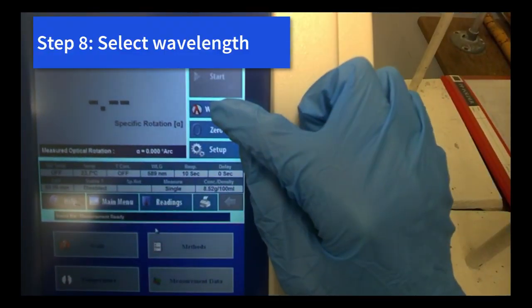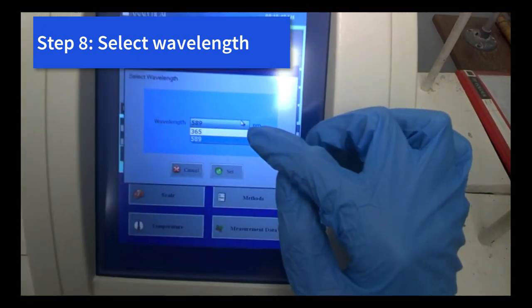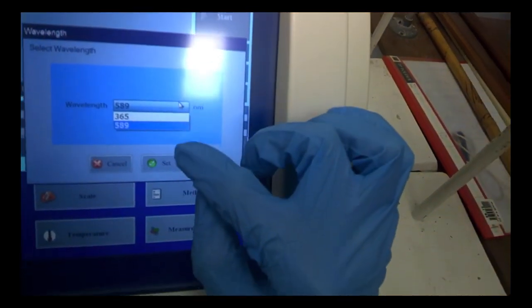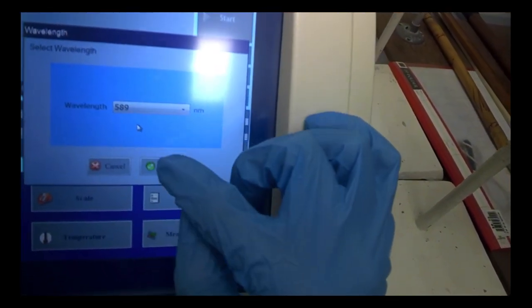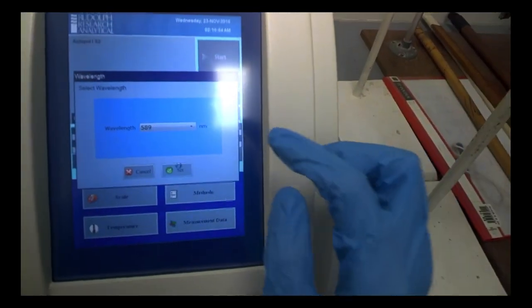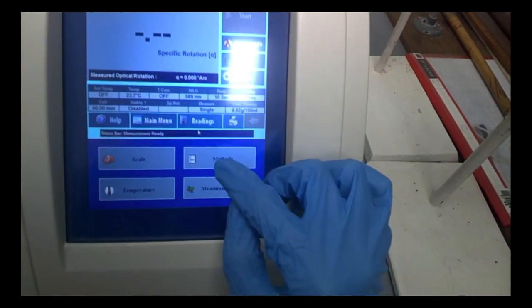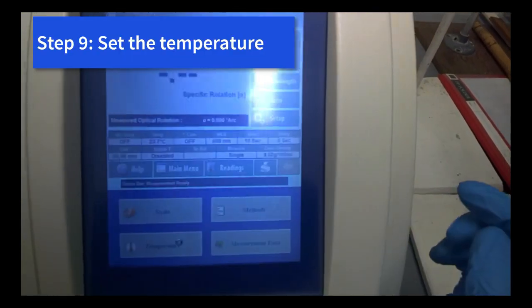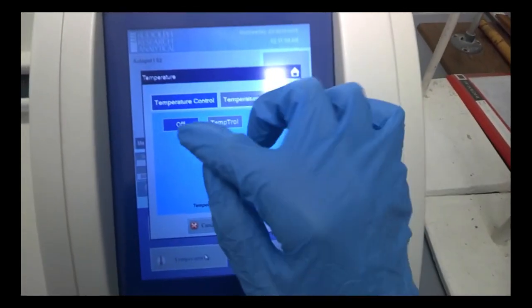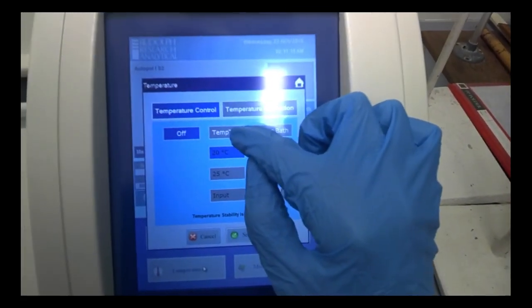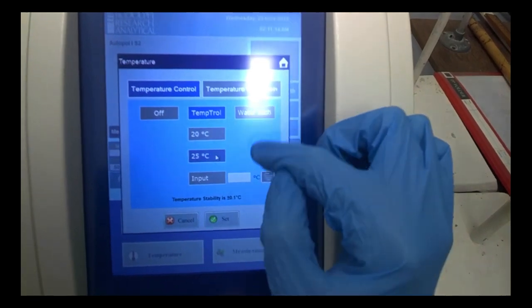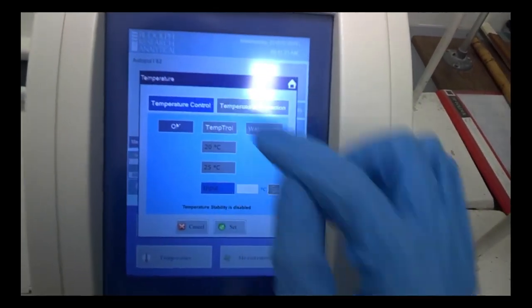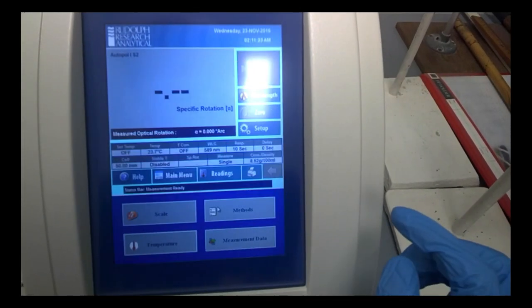Now, there's a few things you can do here. Wavelength: we can adjust to two kinds of wavelength for this machine, either 365 nanometers or 589 nanometers. So here in this case we are using 589 nanometers. Reset it. And if you want to, you can also set your own method, different kinds of methods. Temperature: we can also set whatever temperature we'd like to scan. For now it is off. If you'd like to use temperature control, we can set 20 or 25 or selected temperature here. So the machine is going to warm up to that temperature before you scan.